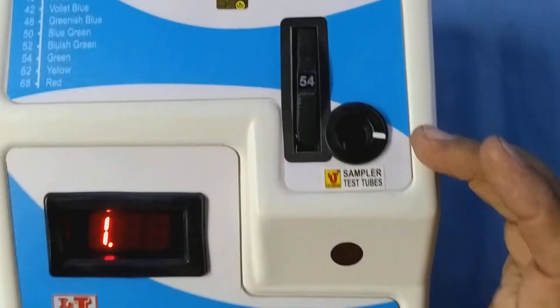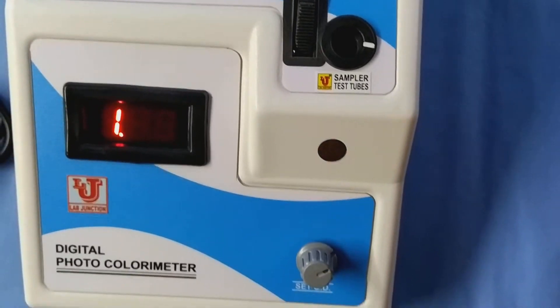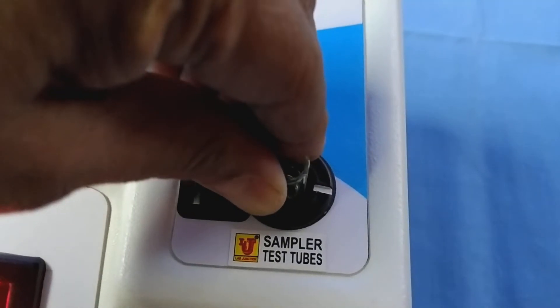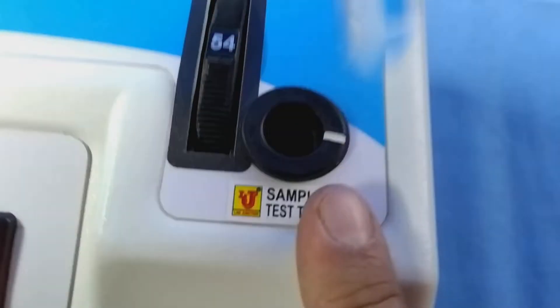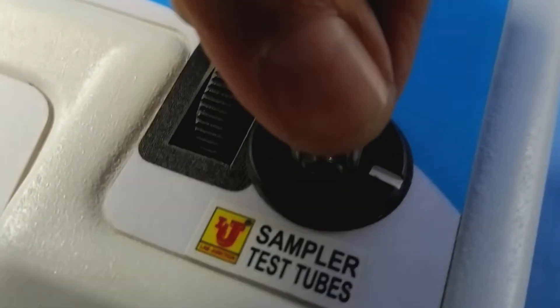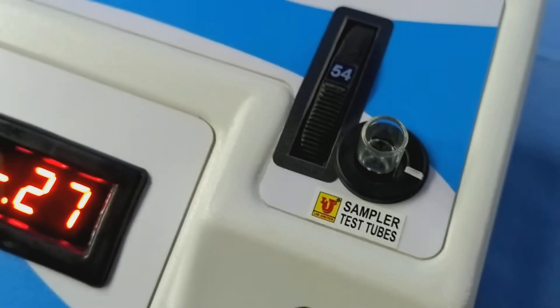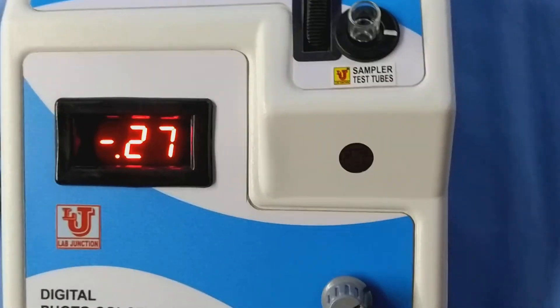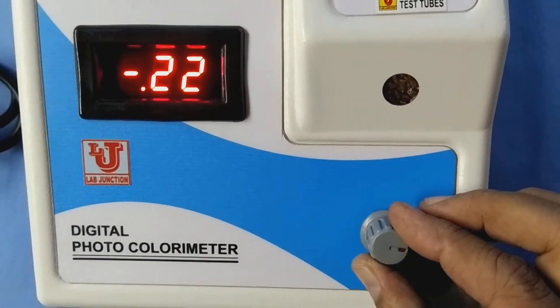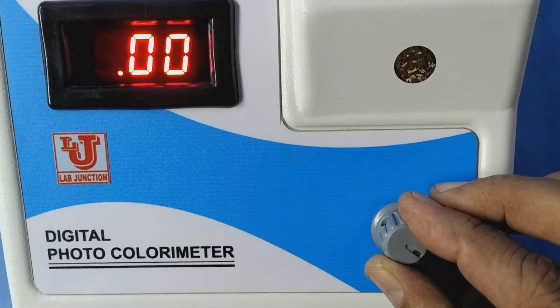This is the sampler for test tubes. Now, first insert your blank in the test tube holder. You coincide this mark with this mark, like this, and properly insert. And set 0.00 from the set OD knob.